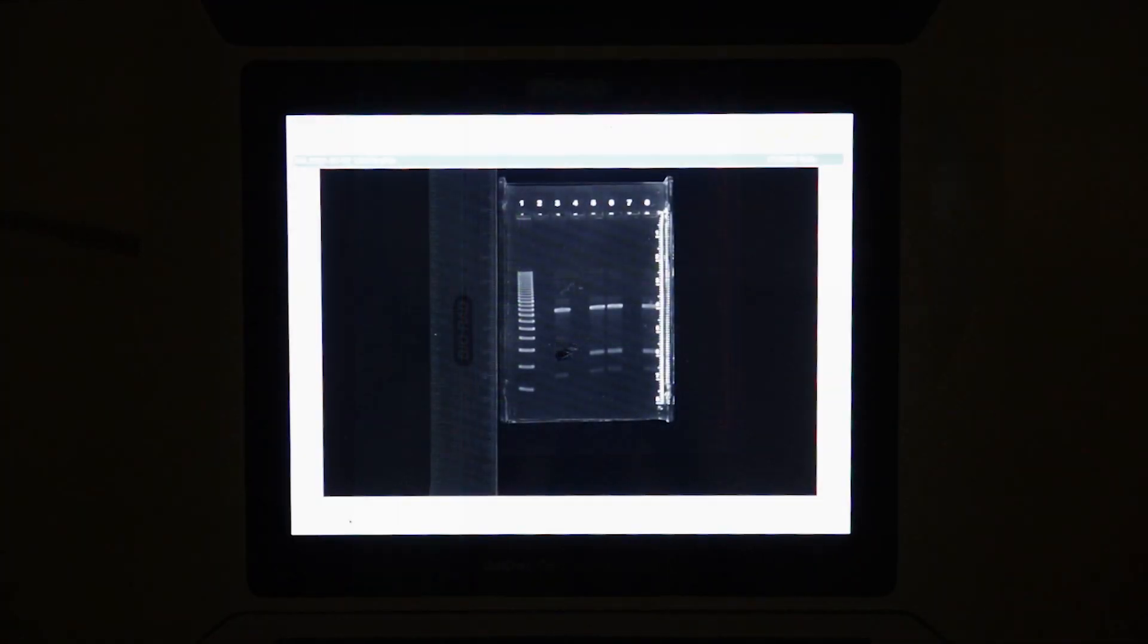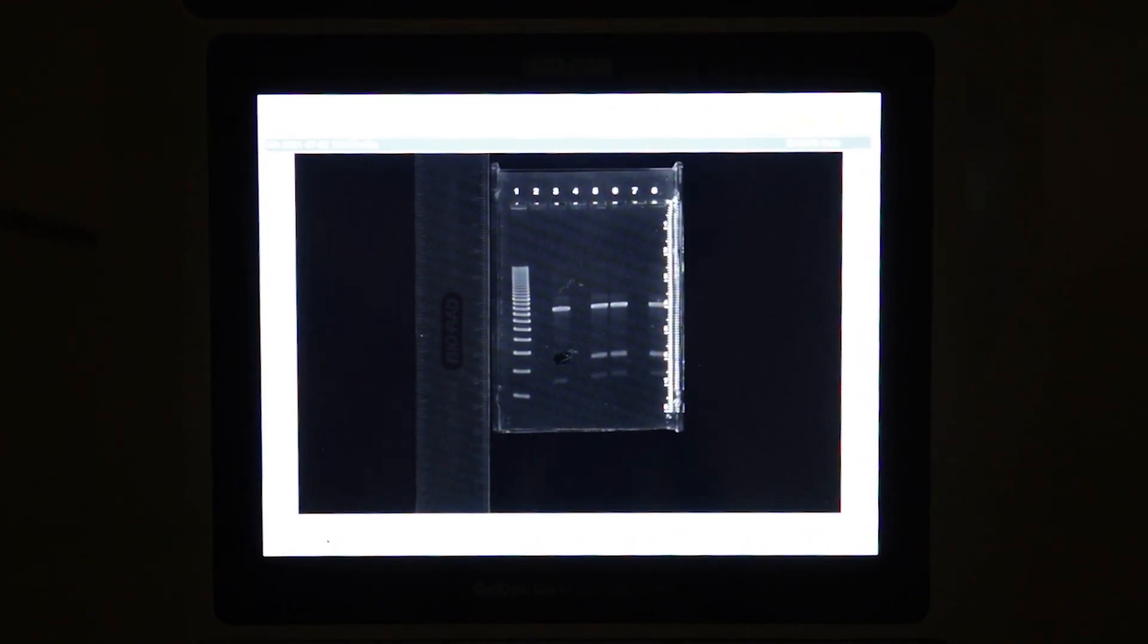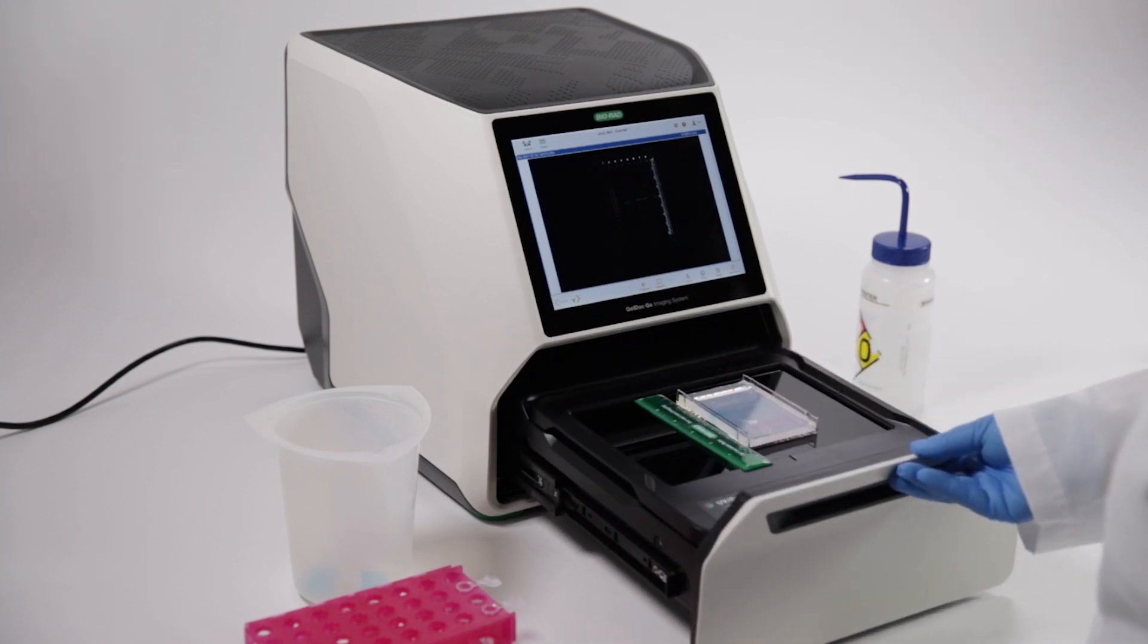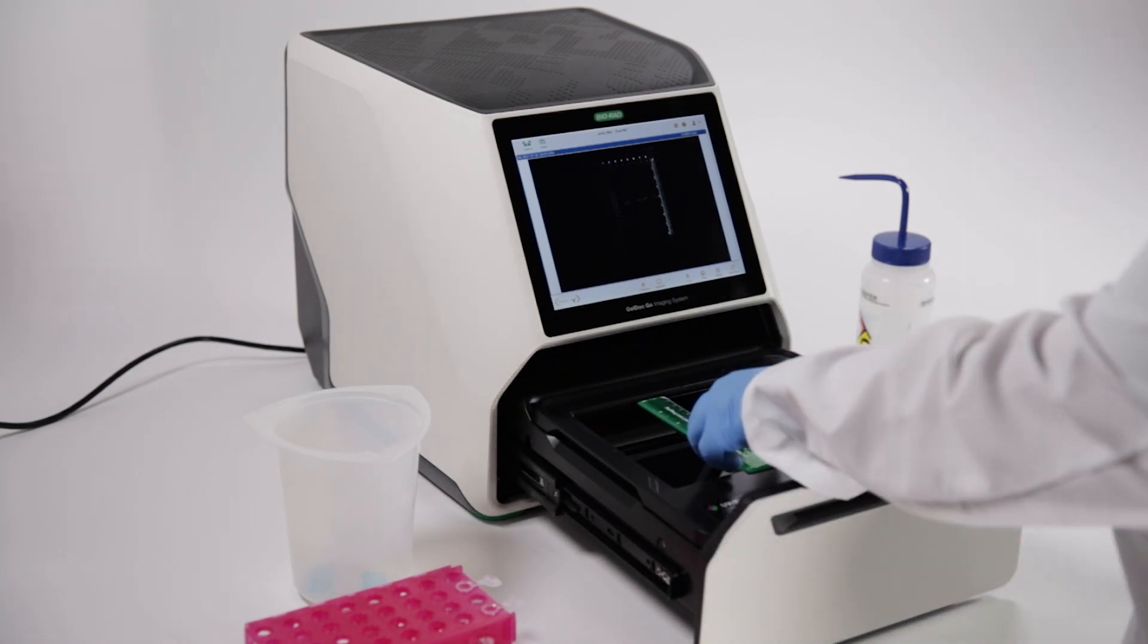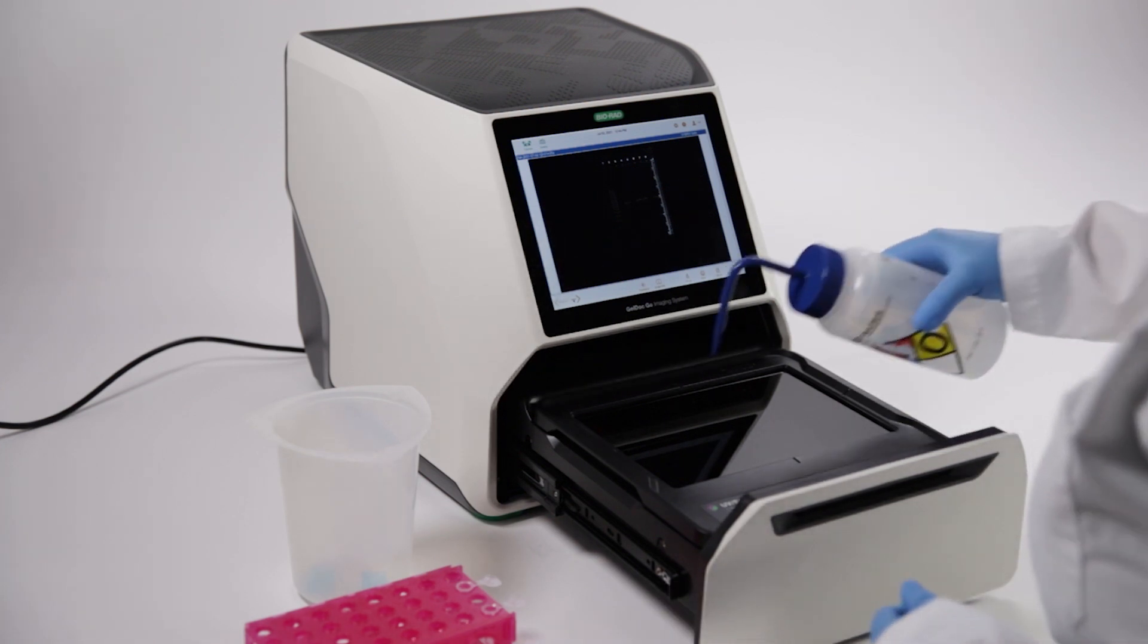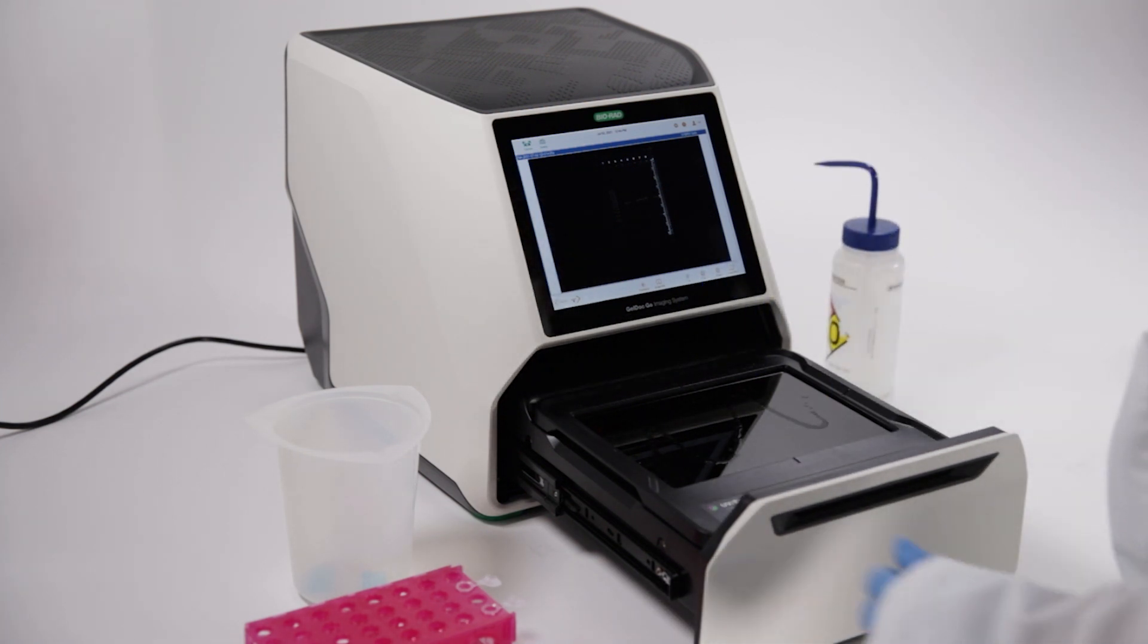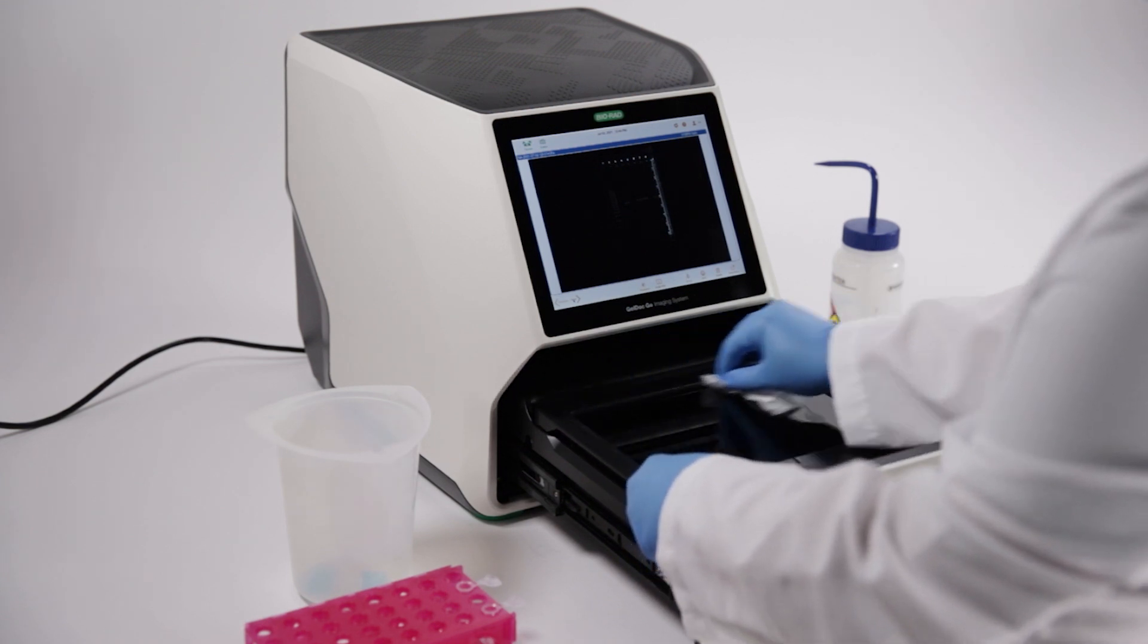When finished, image the gel again to check that the desired bands have been excised. Finally, don't forget to clean up. Make sure to remove the gels and wipe down the tray with a lint-free wipe. This will make sure the instrument is ready for the next user.